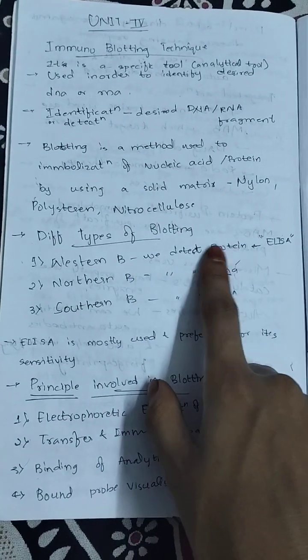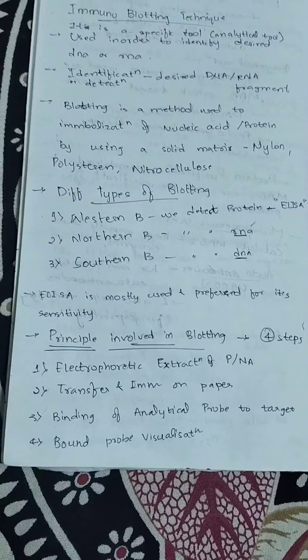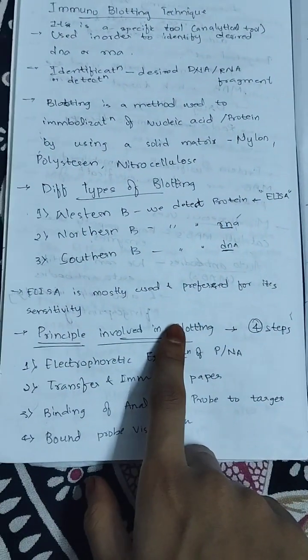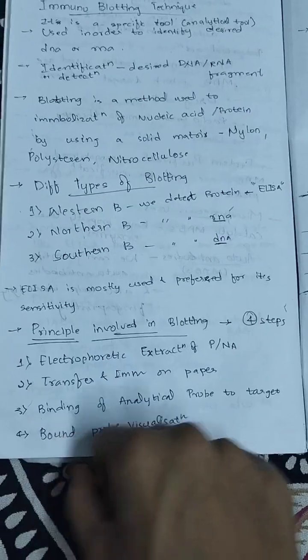We can also detect protein with the help of ELISA. Now, what is ELISA? ELISA is mostly used because it is mostly preferred for its sensitivity.